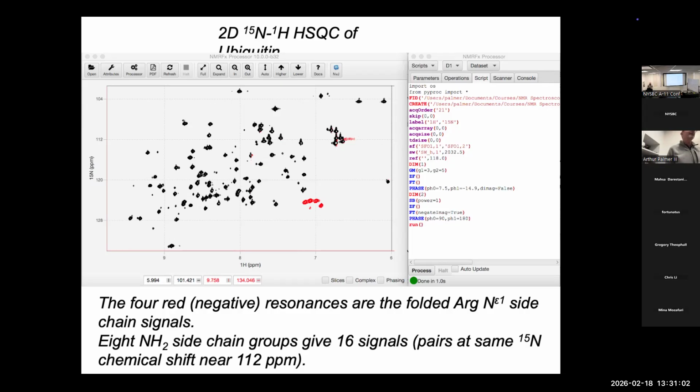Well, the exchange with solvent is very slow for carbons. But we could grow E. coli on fractional D2O and H2O, and then get a distribution, say in the methyl groups, of CH3s, CHD2s, CH2Ds, and CD3s.